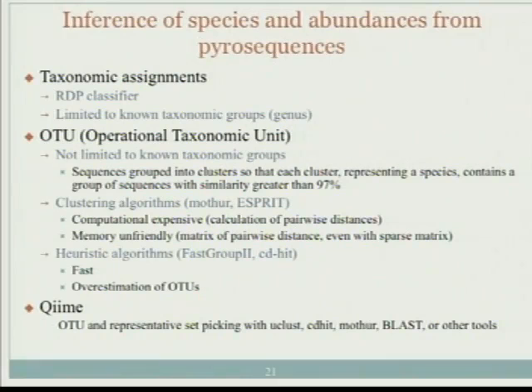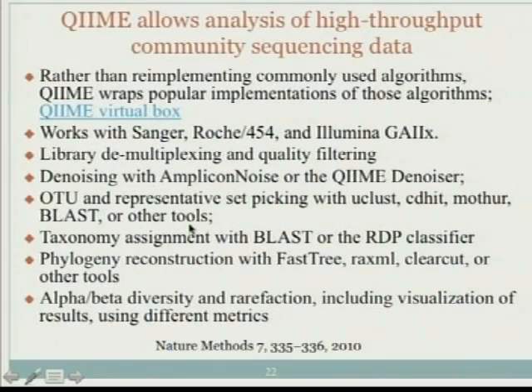But actually, it's a wrapper. It really wraps everything. So it does provide analysis for taxonomic assignments and also OTU-based analysis. And also, it provides a very nice visualization of the results. And they also provide a virtual box because they include so many third-party softwares. So if you want to install, it will be even difficult to install that package on your own server.